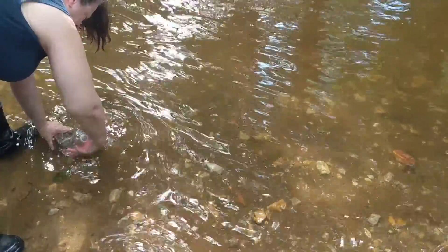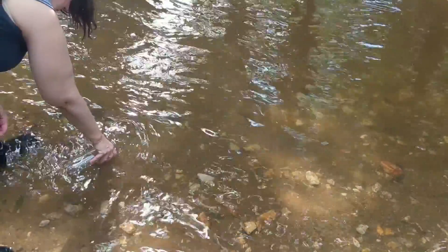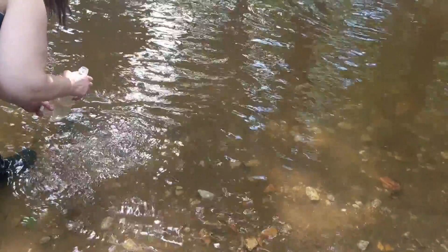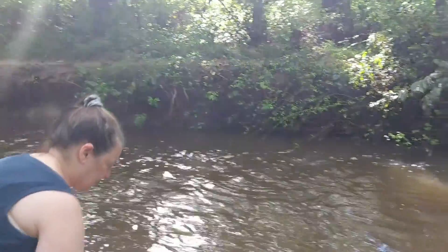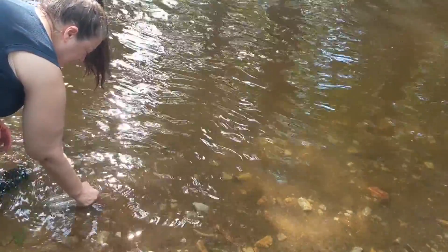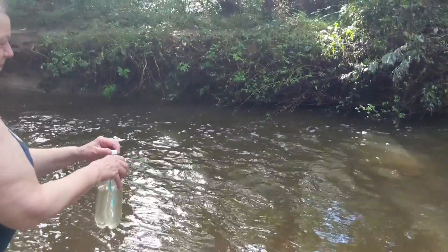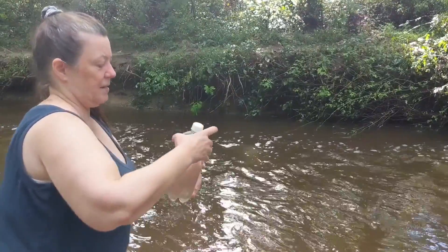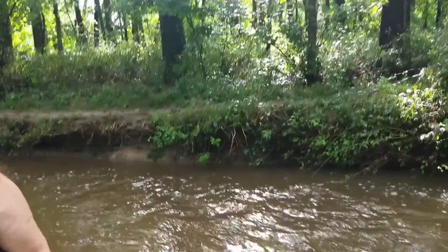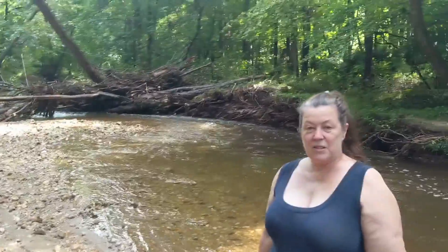I'm just going to fill this up — there should be plenty of water. We'll need a little bit to mix in with the mud to get it the right consistency. We're going to take our materials back home to the driveway and move on to the next step in putting together our Winogradsky column.